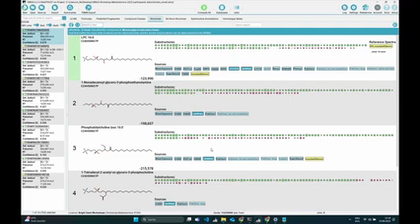So, yeah, sometimes during the picking, a double charged ion can be picked, and you also mentioned that SIRIUS works only with single charged ions. In molecular networking, sometimes I see that ion in the network of a certain class of compounds, but I don't have any information from SIRIUS.